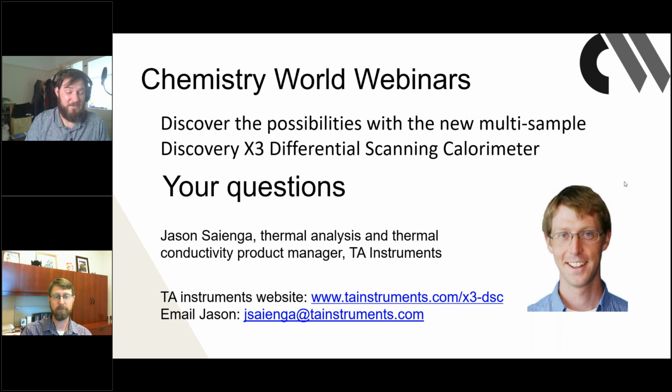Pintu has asked a couple of really good questions, actually. Slightly taking a step back, Pintu says, how is DSC different from differential thermal analysis? So I'll say, differential thermal analysis in many ways doesn't have a heat flow component. It's just a difference in temperature that you might see. As you go through an experiment, an exotherm would have an increase in temperature versus a reference. An endotherm would have a decrease in temperature versus a reference.